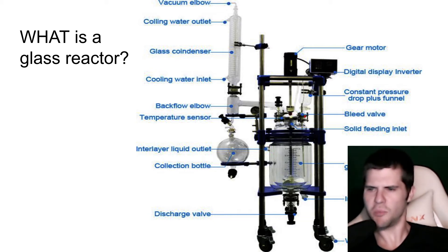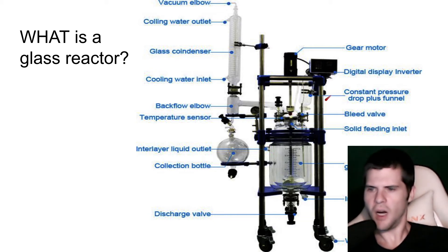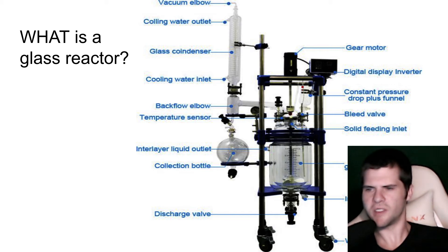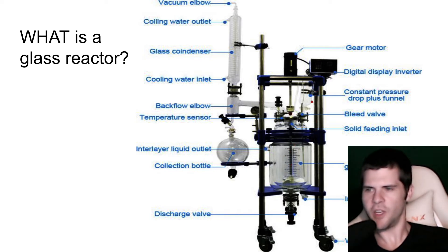Here you have the feeding inlet, which is where we will be able to transfer material into the actual glass reactor for the reaction to take place. Right here, this little guy is a bleed valve, and this bleed valve is actually only for bleeding oxygen into the reaction depending on what reaction you're doing. It can also be used as an auxiliary port. Here you have a constant pressure drop plus funnel, so if you wanted to use a graduated cylinder to measure how much of each specific material you're allowing to feed in, you can use that for that.